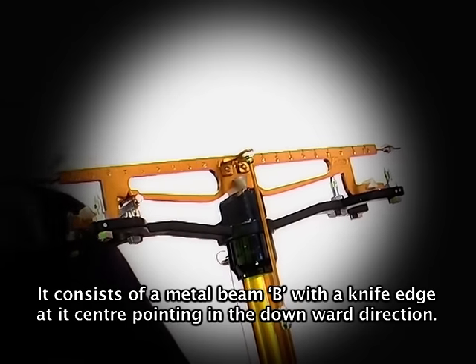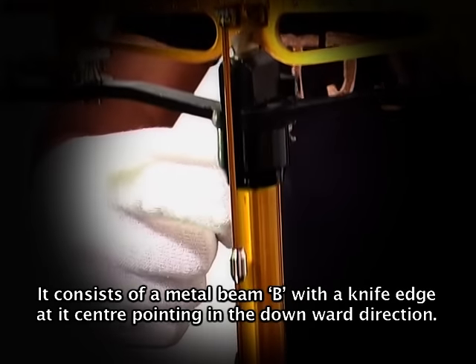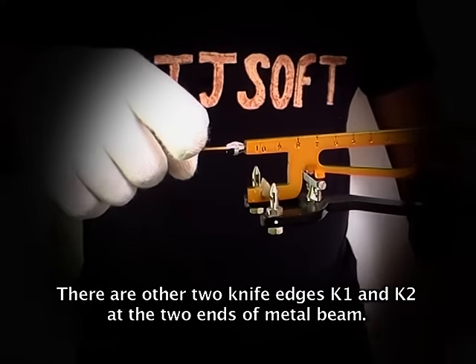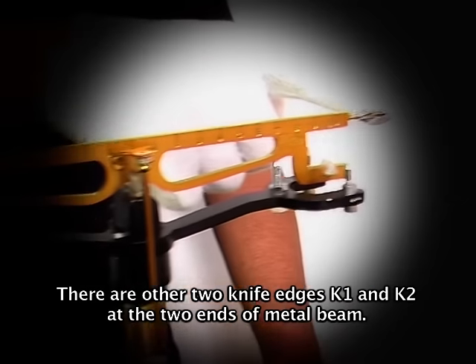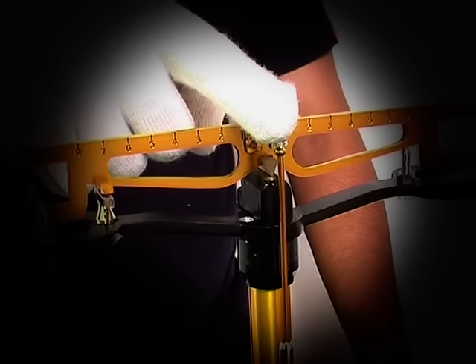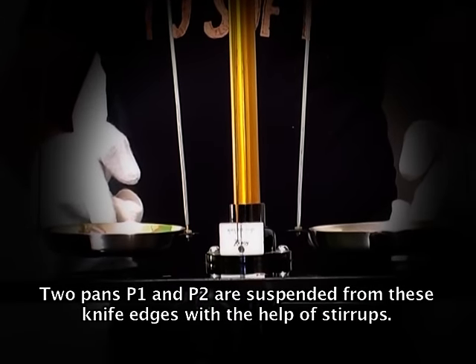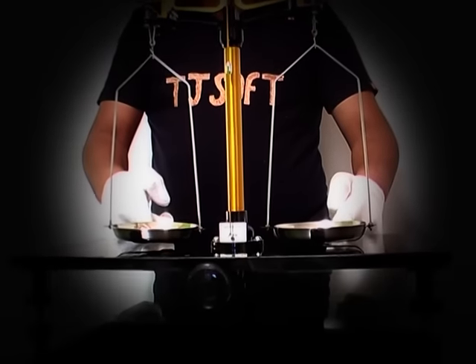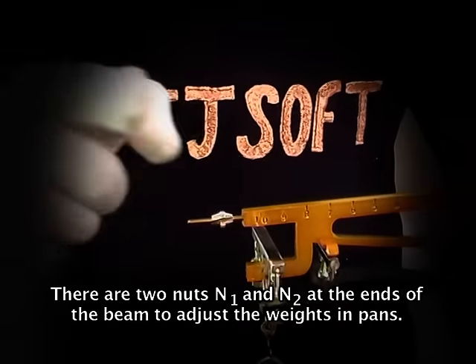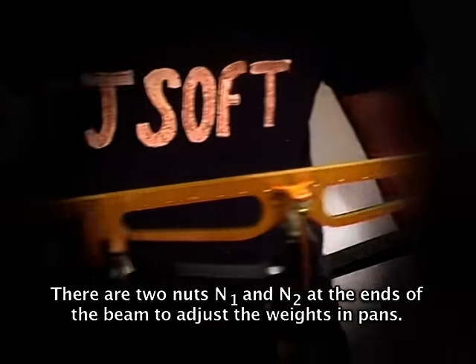It consists of a metal beam with a knife edge at its center pointing in the downward direction. There are two other knife edges K1 and K2 at the two ends of the metal beam. The two pans P1 and P2 are suspended from these knife edges with the help of stirrups. There are two nuts N1 and N2 at the ends of the beam to adjust the weights in the pan.